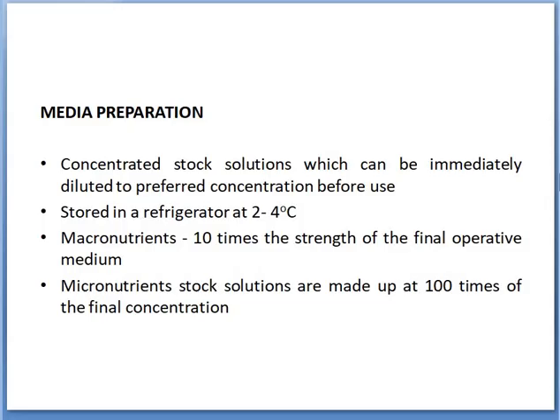Otherwise, the presence of iron in the media will interfere with the absorption of other nutrients in the media by the plant. As such, iron is prepared as a chelated solution using EDTA. So, the FeEDTA allows slow release of iron into the tissue culture media as and when required. As the concentration of iron keeps on decreasing in the media due to absorption and usage by the growing tissues, more iron is released into the media.